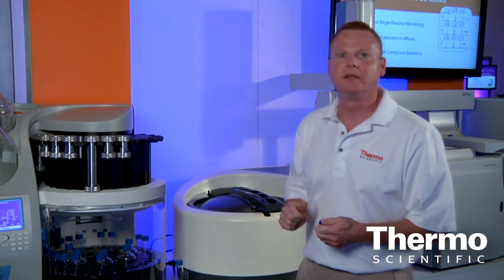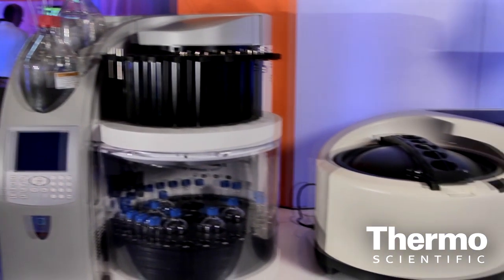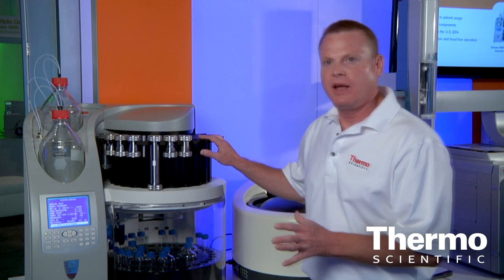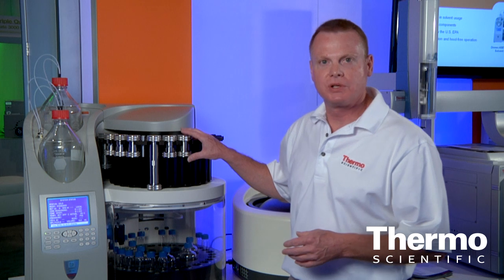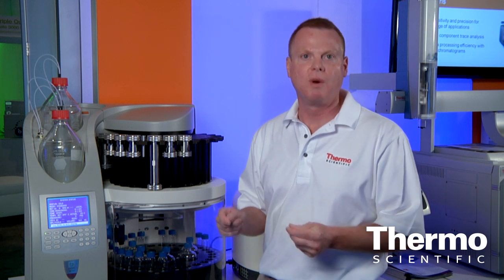Up to 90% of solvents such as acetonitrile and water can be recovered. Traditionally, these analyses are performed over long periods of time with large amounts of organic solvents. The advantage of ACE is that it operates at temperatures above the normal boiling point of most solvents, and that increases the dynamics of the extraction — specifically, solubility and diffusion are greatly enhanced. So instead of a 24-hour extraction by traditional techniques, we're able to get the same extraction efficiency and results in 20 to 25 minutes using a small amount of organic solvent.